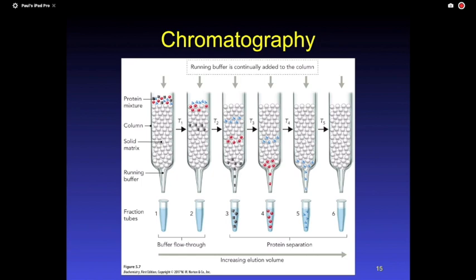All right, we're going to coat them. And so some of the proteins are going to be attracted to that, what's called the solid phase, okay? And they will stick to it. Some doesn't stick to it. And so when you put your material, that mixture of proteins on the top, what's going to happen is everything's going to kind of be there and stick to it, okay? Because it's actually touching. But how do I actually know if it's actually making an interaction that wants to stick to the beads or is just sitting there because it's there?